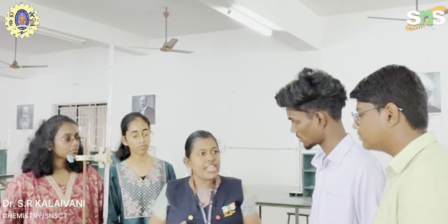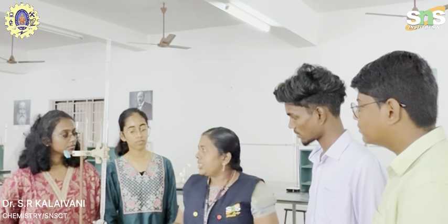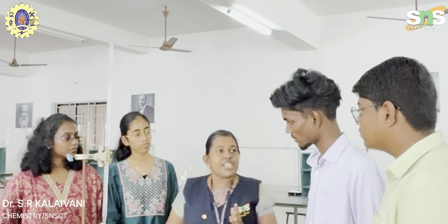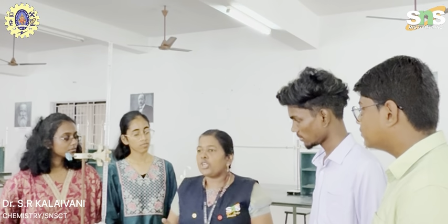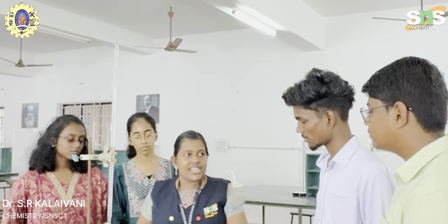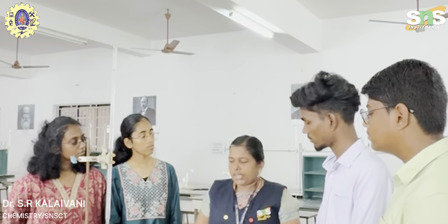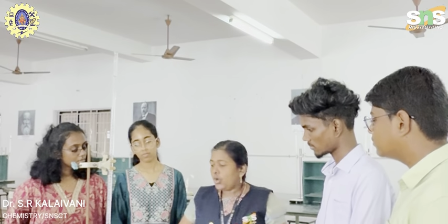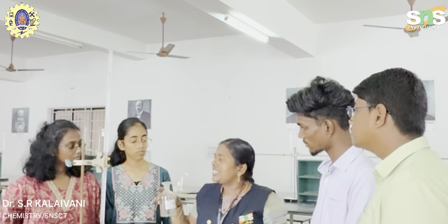Generally, water is the main source for all human beings, animals, plants, etc. So the water must be free from all types of impurities. In this experiment, we can find out the amount of hardness present in the water sample by using EDTA solution. Actually, this EDTA solution is a complex solution because pure EDTA is insoluble in water. So, the disodium salt of EDTA is used in this experiment.